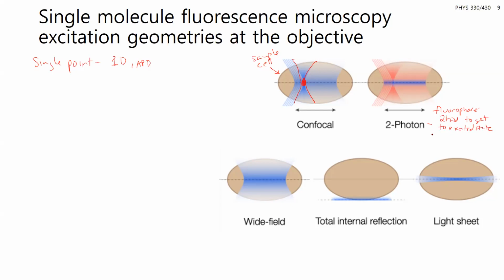So this typically uses redder wavelengths, and the benefit of using two photon microscopy is this decreases the size of your focal volume. So you can see that only in the concentrated area where that focal volume is, it reduces some of the fluorescence above and below this area. So this is a somewhat specialized form of confocal microscopy.